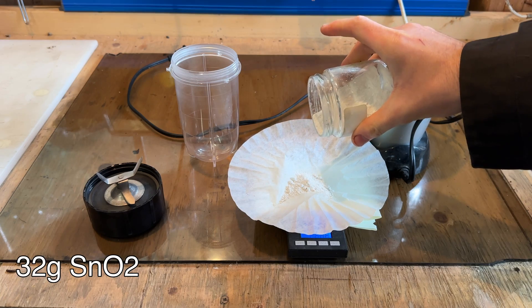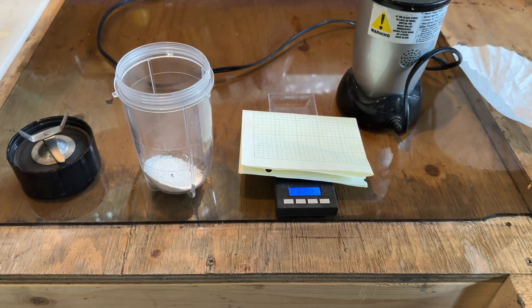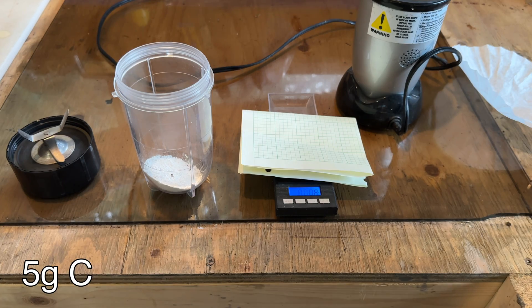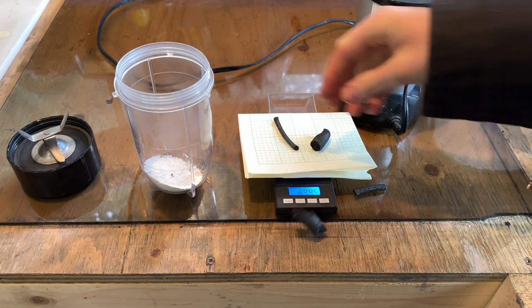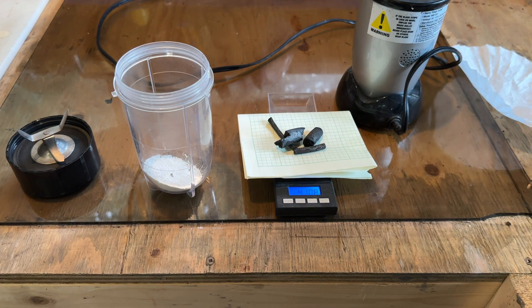To begin, we can weigh out 32 grams of tin-4 oxide. This can be purchased at pottery supply stores. Next we can measure out 5 grams of charcoal, or another source of carbon. This is a stoichiometric excess of carbon, but this will ensure that all of the tin-4 oxide is reduced to elemental tin.